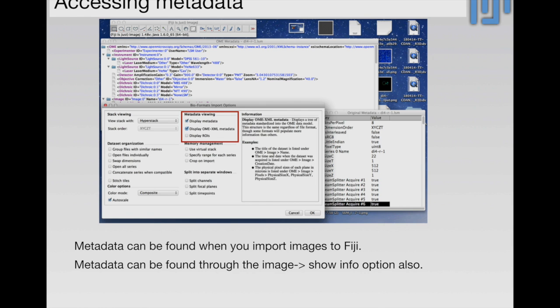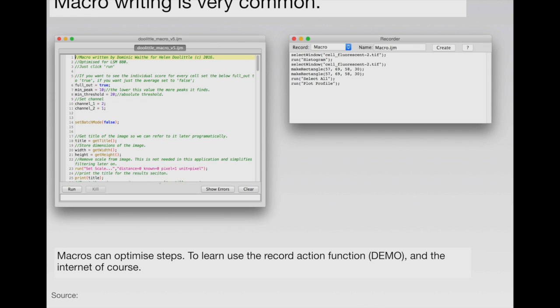It's written in Java originally, but the scripting language can be many different languages. So they have something called Jython, if you like Python, which is like using the same syntax as Python, but it speaks to Java. They also have JavaScript. They also have ImageJ1 macro language, which is their own one, and they also have Groovy, which is getting very popular. So if you can program any of those, you can use the scripting language. If you want to develop plugins, that's still in Java.